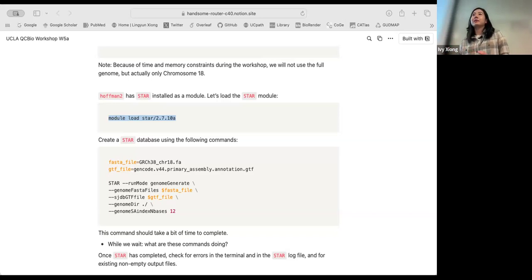Does it make sense? Because it's mRNA, the assumption is the exons are from the same gene. So if there are structural features we can exploit when matching, that's also going to accelerate things quite a lot.